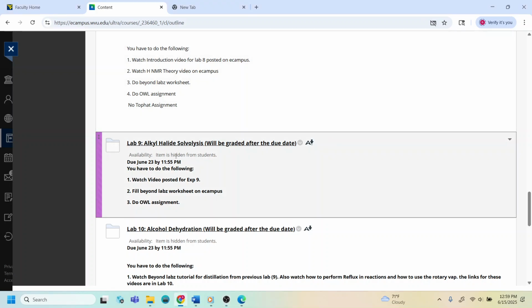This lab will walk you through experiment number 9, which is the alkyl halide solvolysis. So you're already watching the video. You are going to work the experiment and do the OWL assignment.